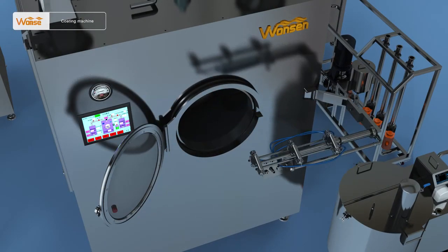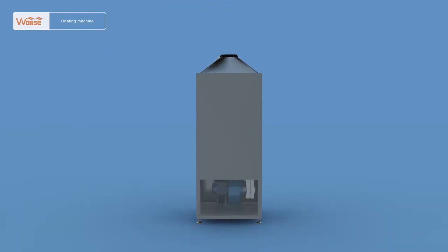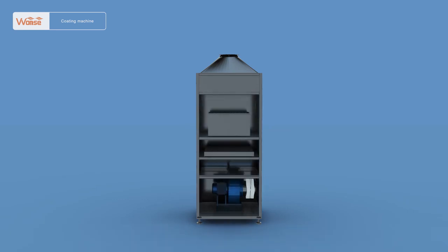The hot air system is mainly composed of the cabinet, centrifugal fan, primary efficiency filter, medium efficiency filter, heat exchanger, and high temperature resistant high efficiency filter.